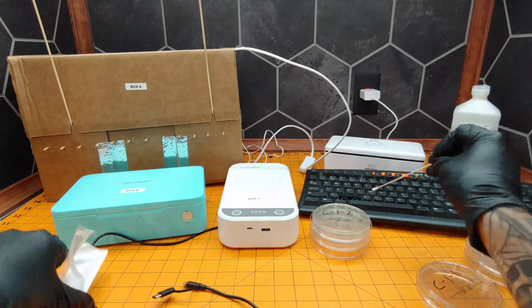Now that we have all of our samples collected, we can put them in the incubator, and I'm going to set up a GoPro, and hopefully we'll get a time lapse of the next 24 hours.